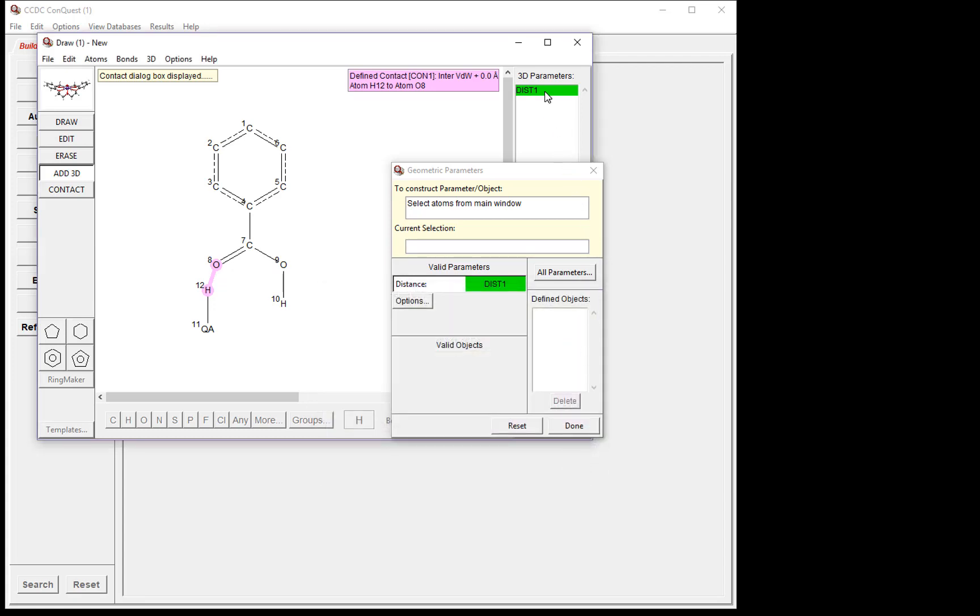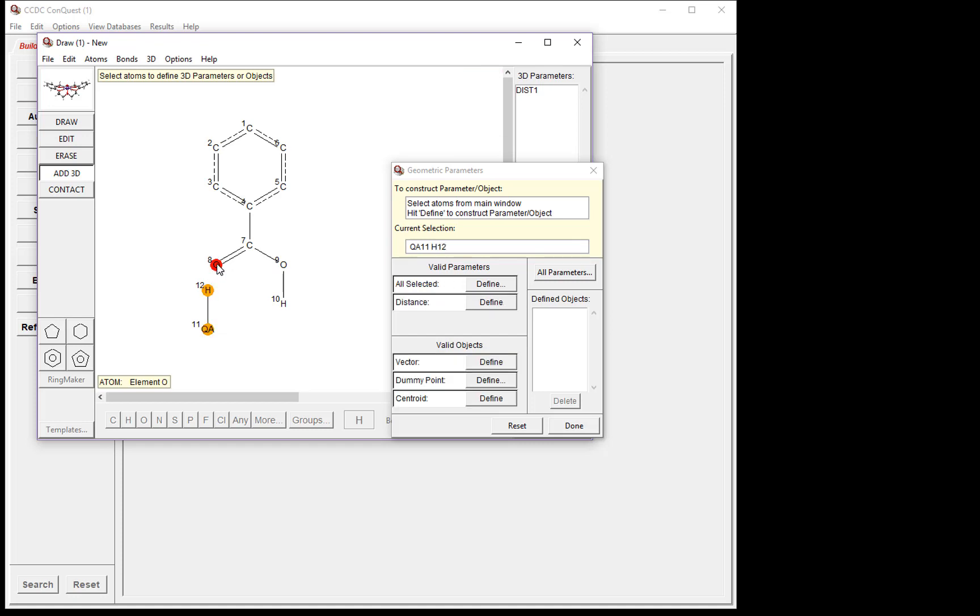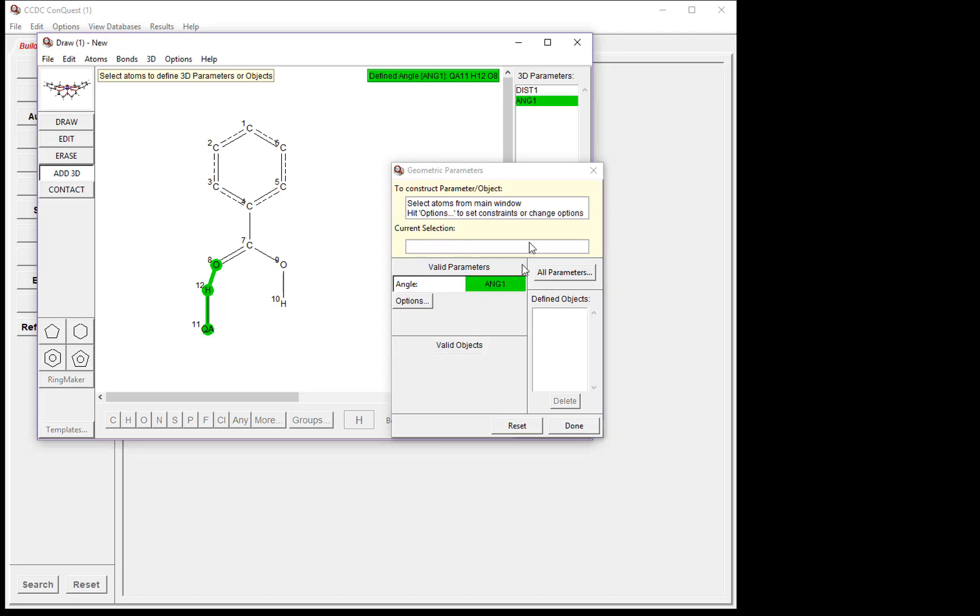Now you'll see we have Distance 1 listed in our parameters list. The next parameter we'd like to investigate is the angle around the hydrogen. To do this, click QA, H, and then O. Now you'll see our parameter has changed to Angle. Click Define. And you'll see we have Angle 1 listed now in our 3D parameter list.